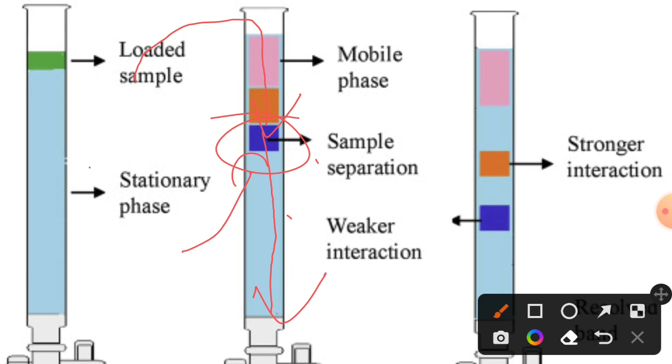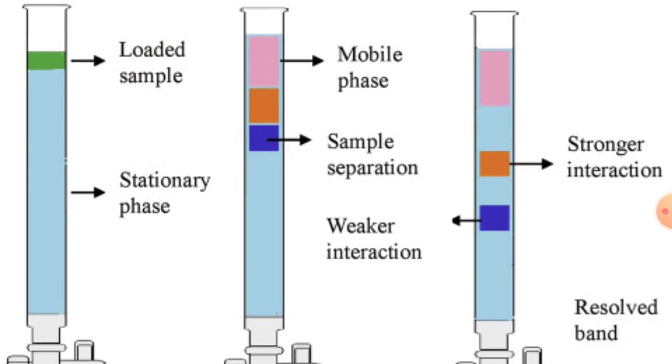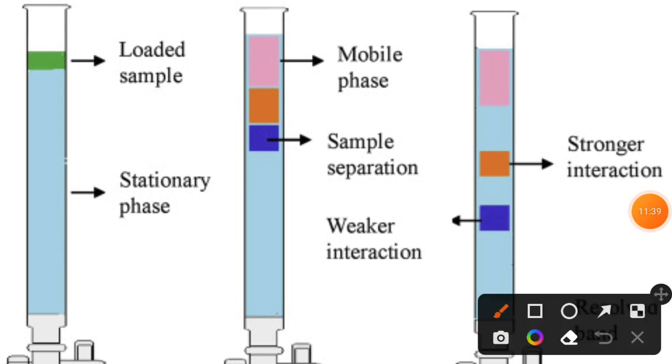So the idea is we are constructing a solid phase, which is nothing but a porous solid matrix. This porous solid matrix contains an appropriate chemical property that we are willing to use to separate our proteins. Then we load our sample on the top of the column. The sample will percolate through the stationary phase and separate depending on the property that we have chosen, okay.